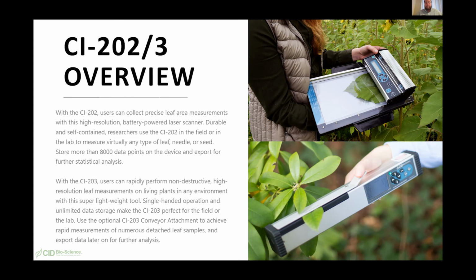So if you have a size or a width that's less than 0.01 centimeters, I guess I would say 0.1 millimeters, if it's less than that, I would not recommend measuring that because it's not going to work for the CI202.